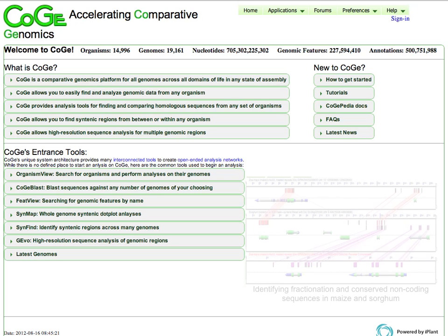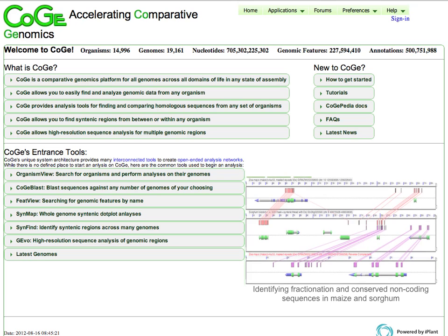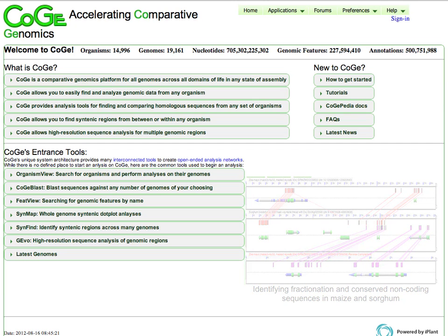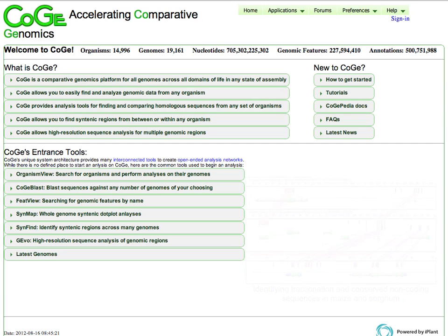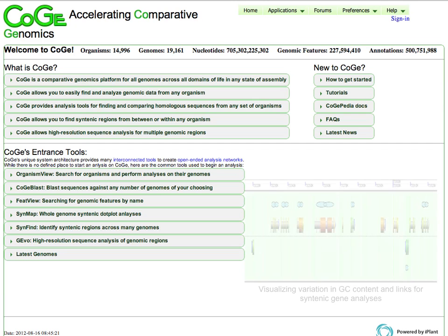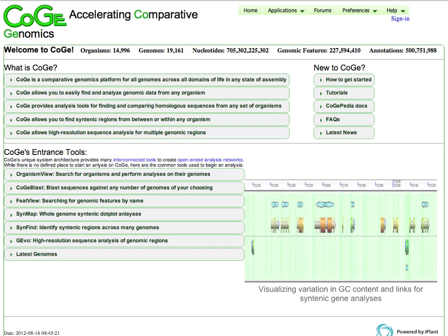Hi, this is Eric Lyons, and this is a quick video tutorial on how to use some of the tools in CoGe in order to generate a syntenic dot plot where you mark on the dot plot where a particular gene is of interest.